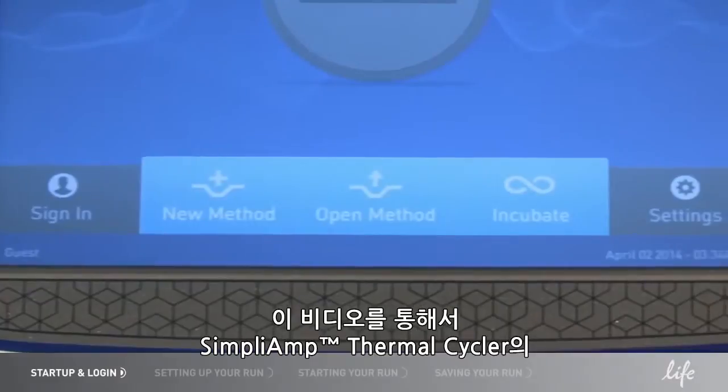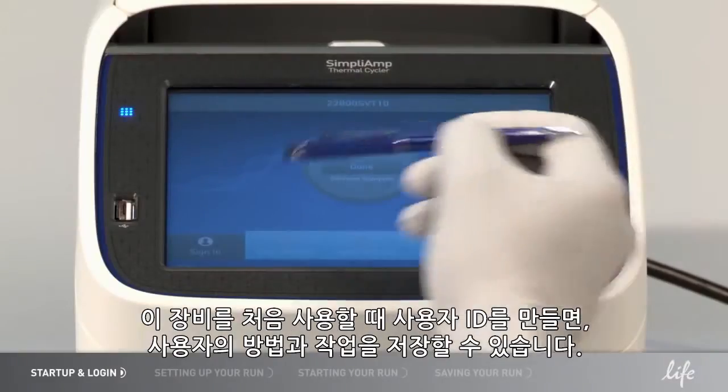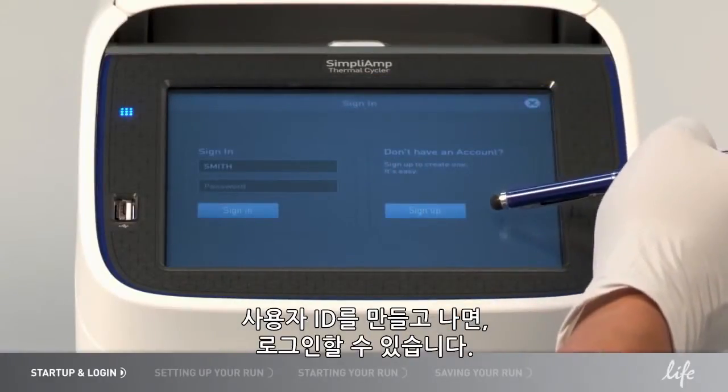In this video, we will show you some simple steps to operate the Simply Amp Thermal Cycler. When you first use the instrument, you can create a user ID if you'd like to save your methods and runs. Once you've created your ID, you can sign in.